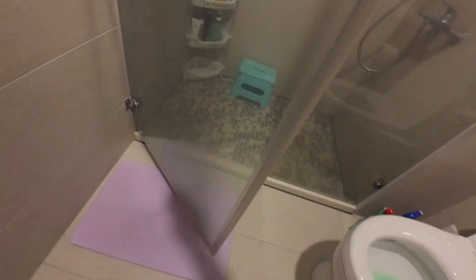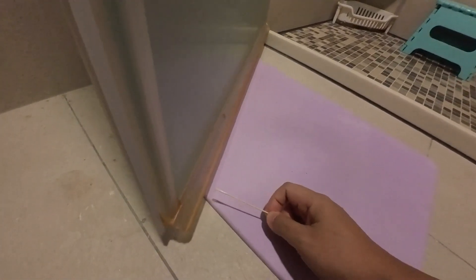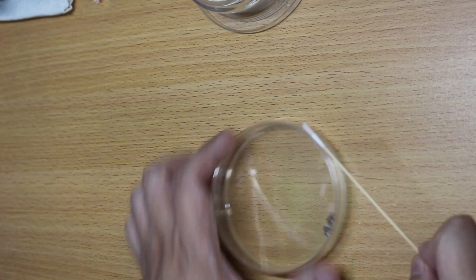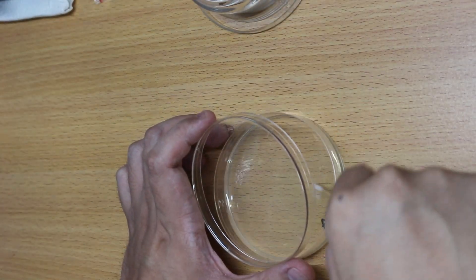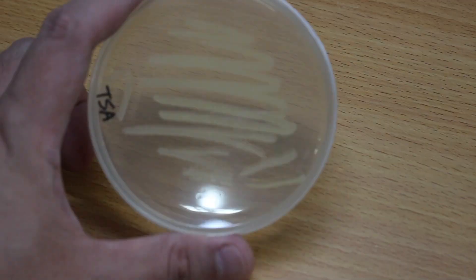Hello everyone, welcome to today's video. A few months ago I took a swab sample from my bathroom because I'm looking for bacteria that I want to add into my collection.